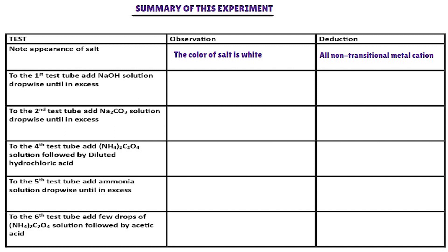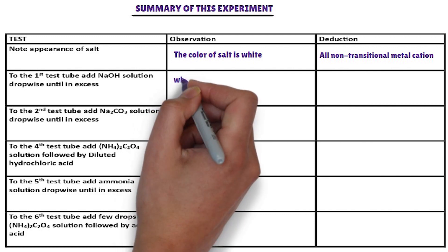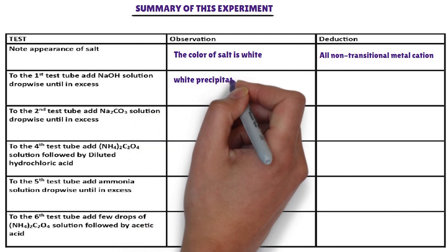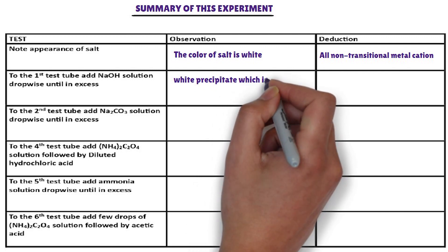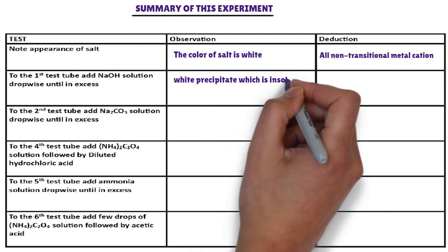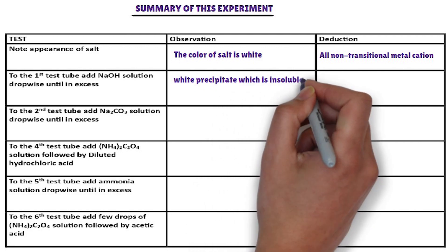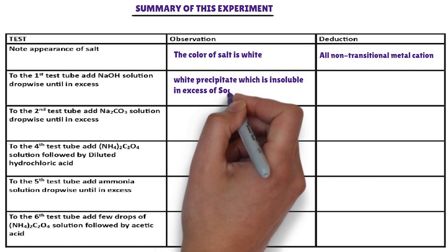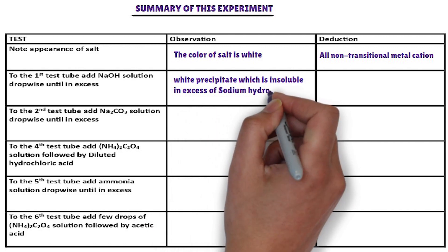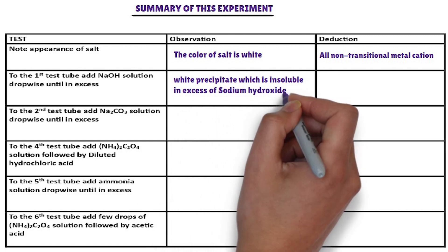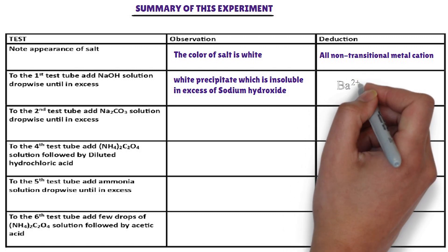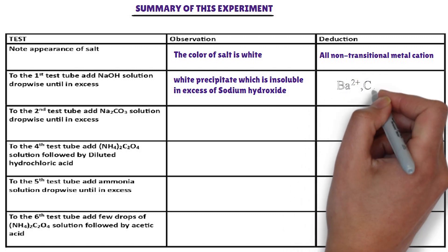In the first test tube, sodium hydroxide solution is added. The cations that form a white precipitate with sodium hydroxide, and the precipitate is insoluble in excess sodium hydroxide, are magnesium ion, calcium ion, and barium ion.